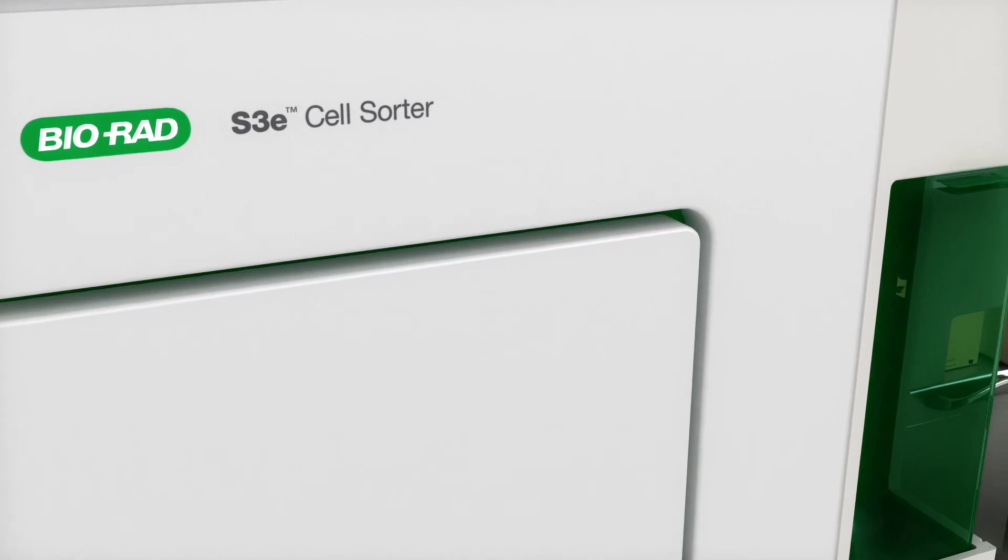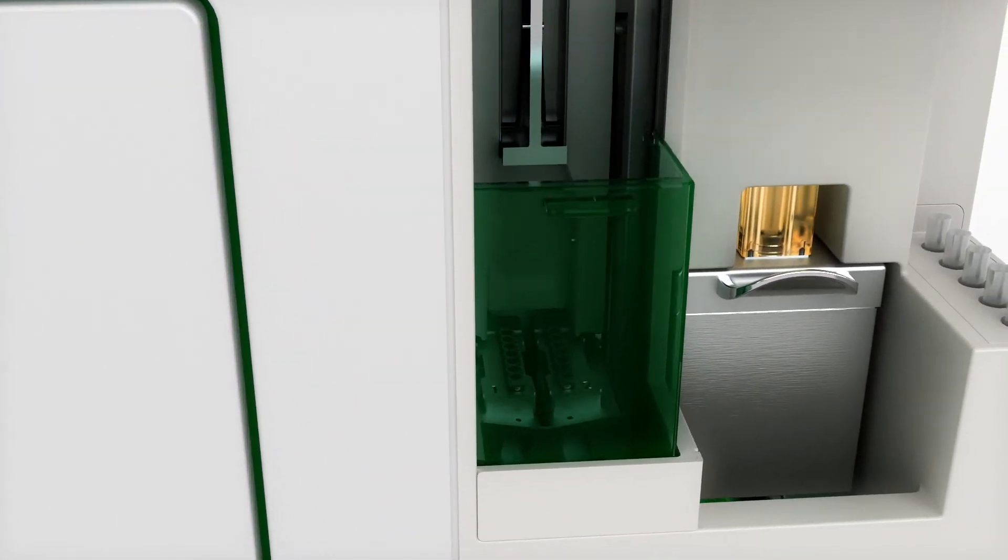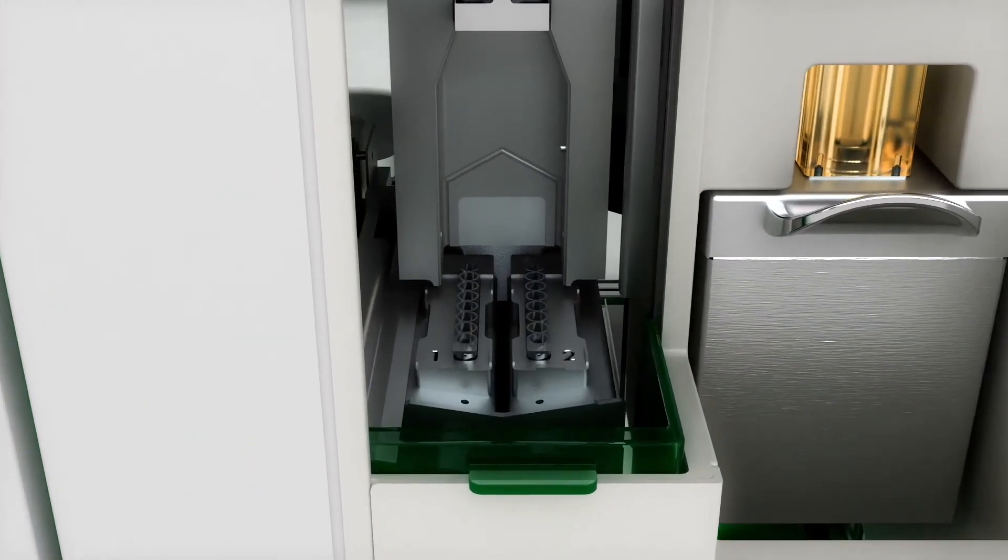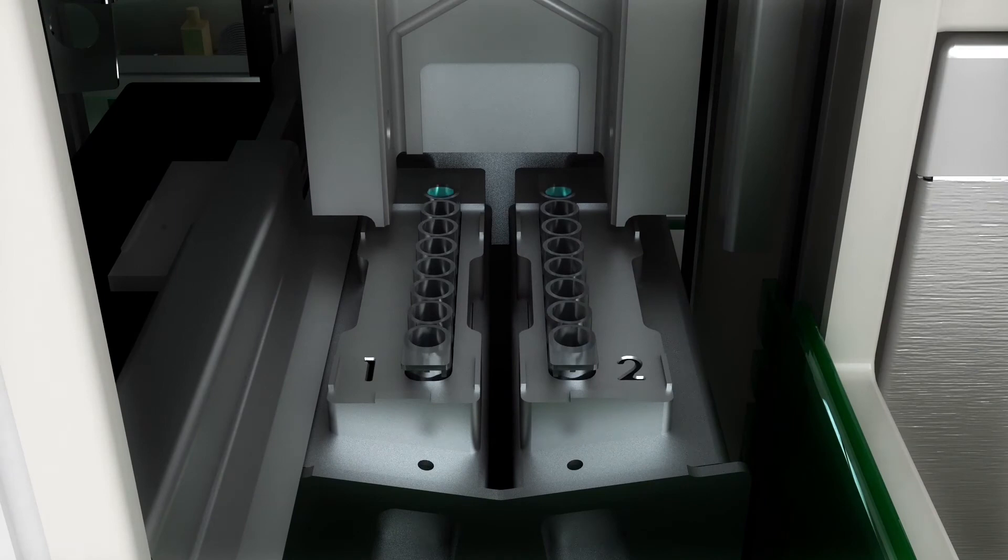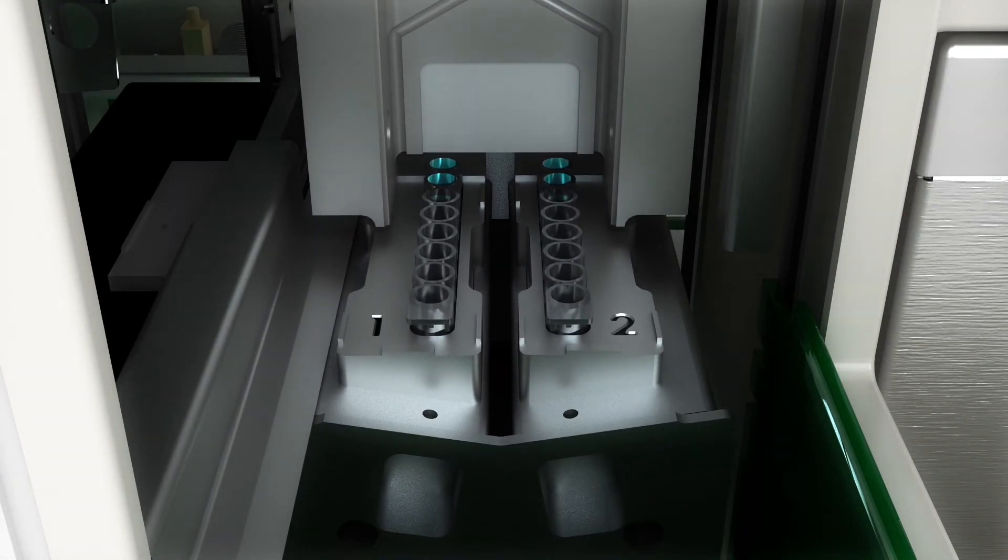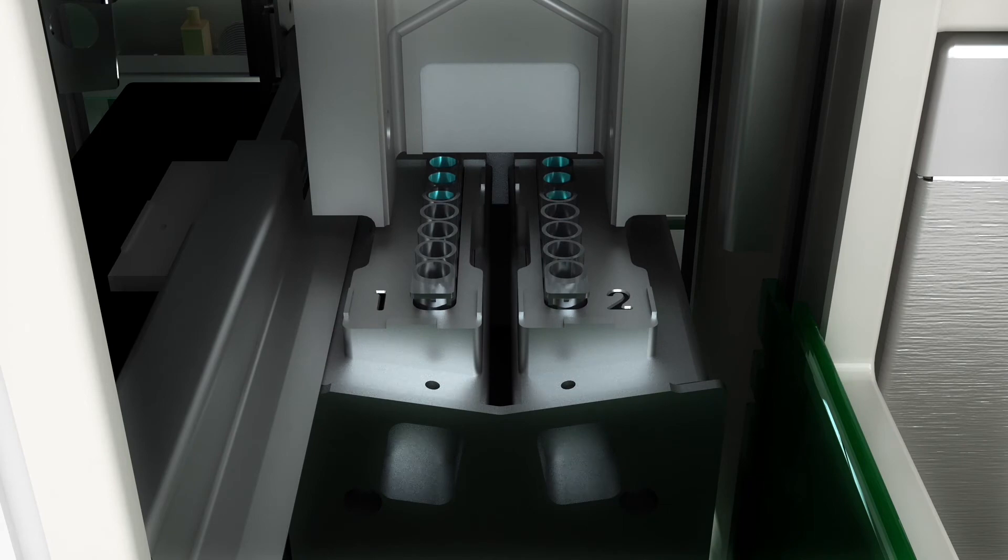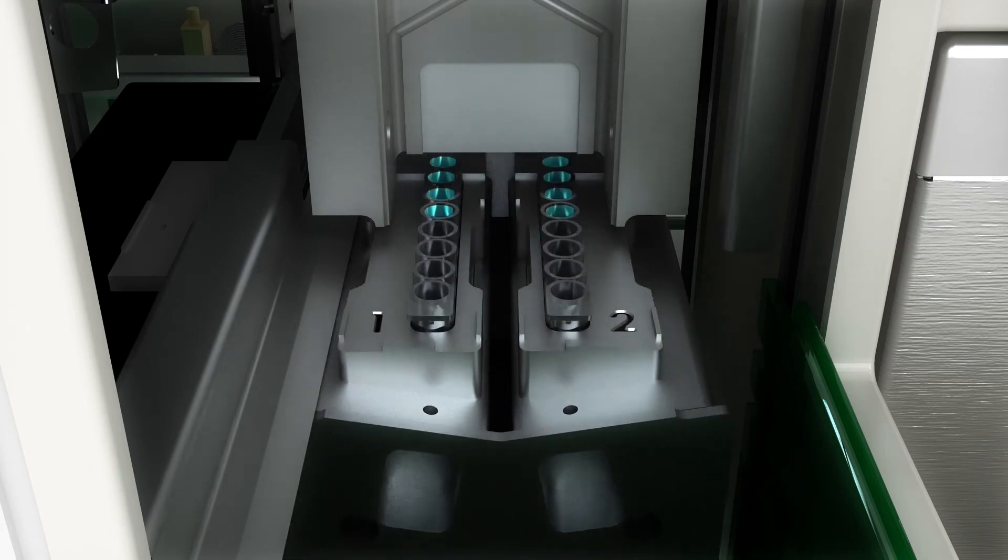The S3E is the only benchtop sorter that lets you set volume limits for collection vessels, so you never have to worry about losing your sorted cells due to overflow. The S3E automatically stops sorting or moves to the next tube position once the volume limit has been reached.